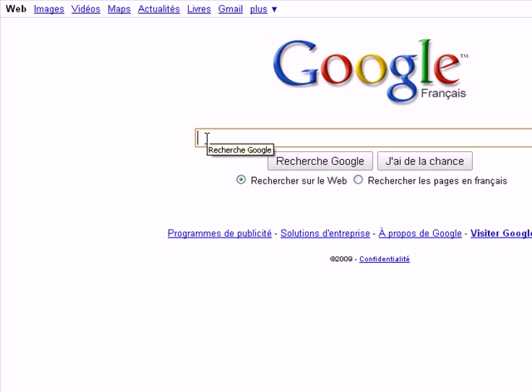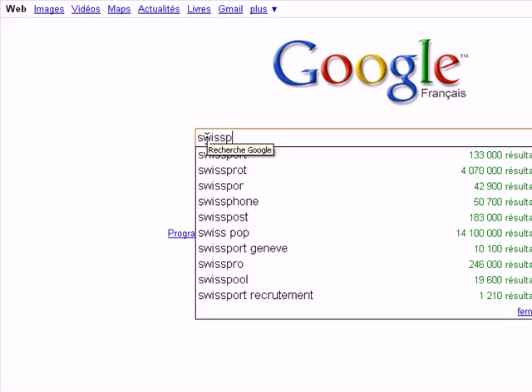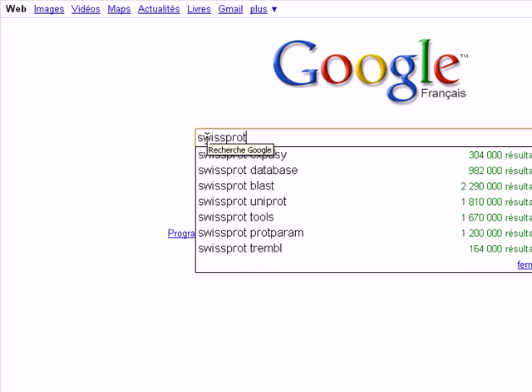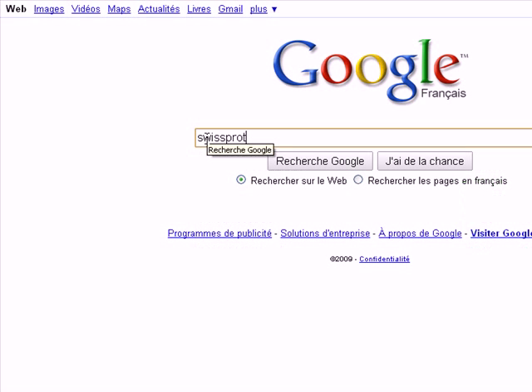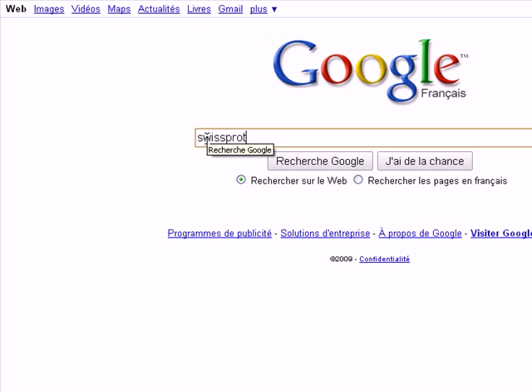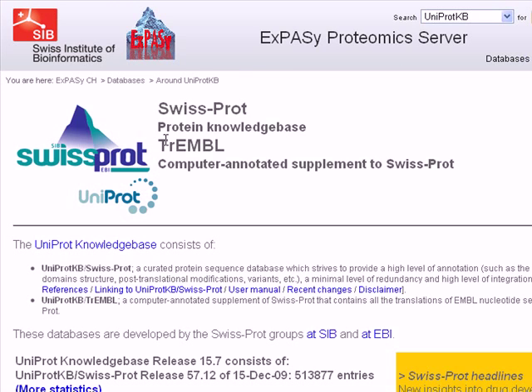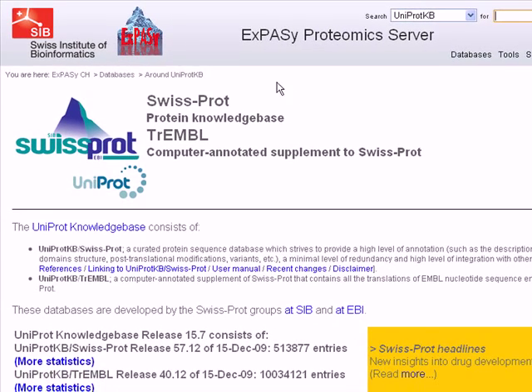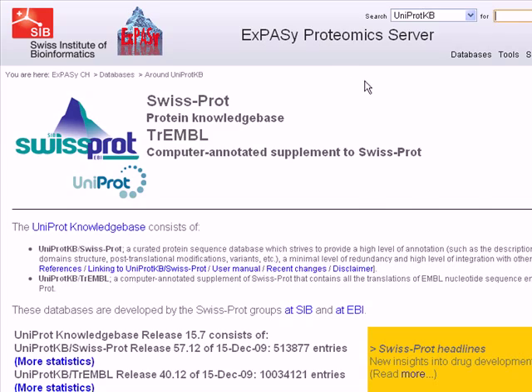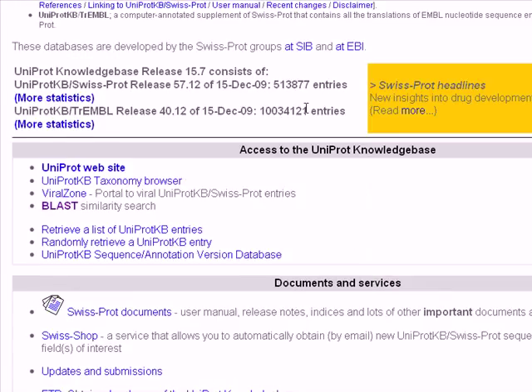You can use whatever you want, for example NCBI-1. We search for the term SwissProt, which is a database hosted by the Expasi server. Click on the first hit. As we can see here, it's the main page of the Expasi Proteomics server.